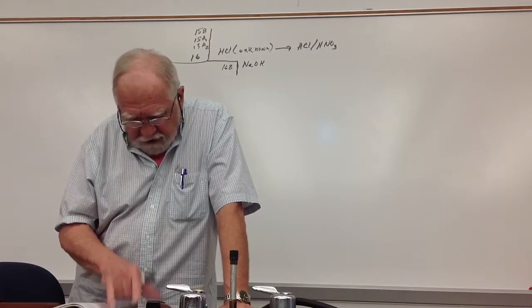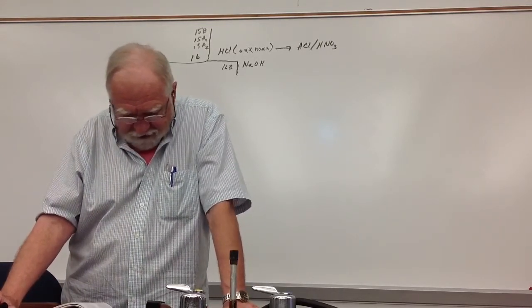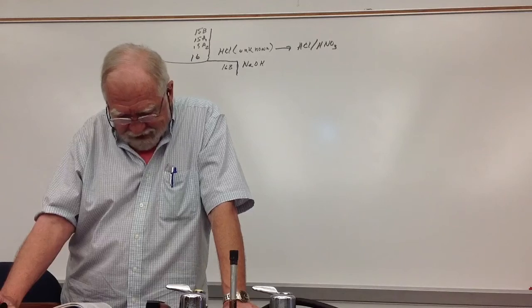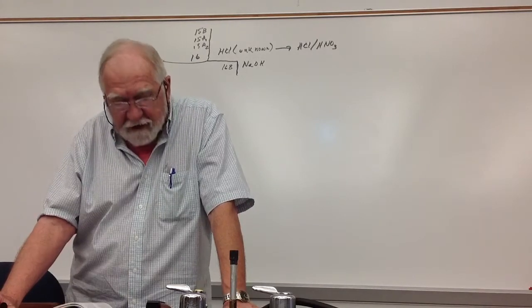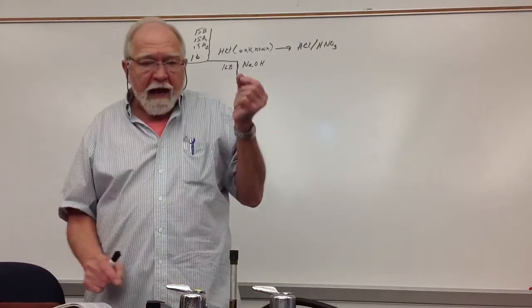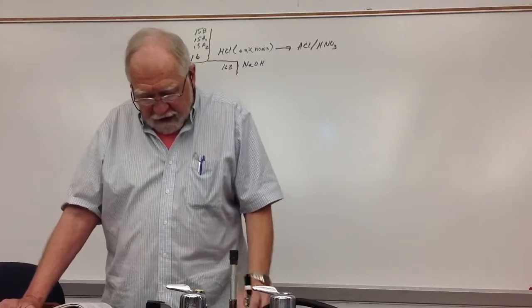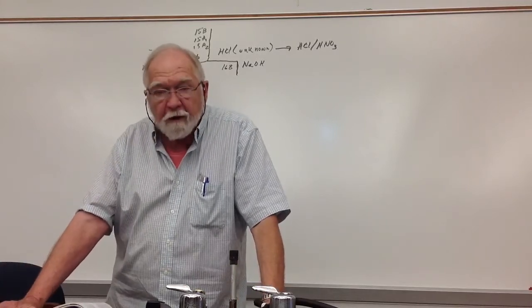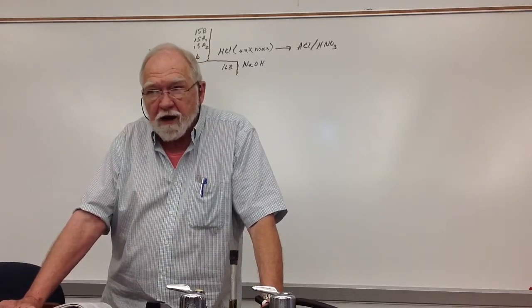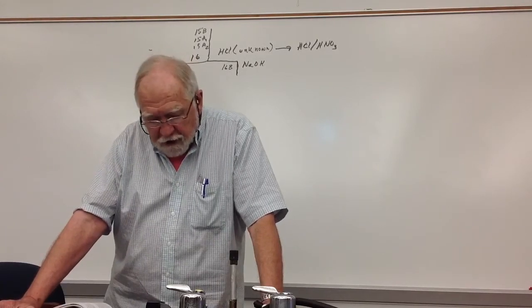It says that if you get so much precipitate that it's really solid or almost mushy or lumpy, in other words, you can't see the fluid, add 10 to 20 drops of water. Instead of 10 to 20 drops of water, you want to add, for each drop of water, 1 drop of sodium hydroxide. So if you're adding 10 drops, it would be 5 drops of water, 5 drops sodium hydroxide. You don't want the sodium hydroxide concentration to get reduced.